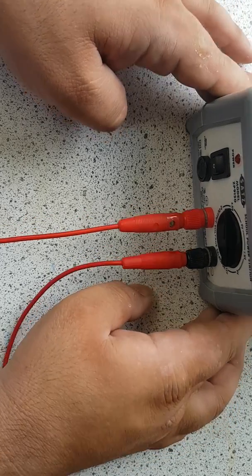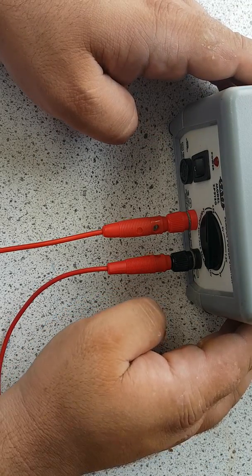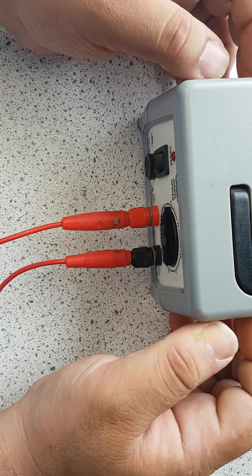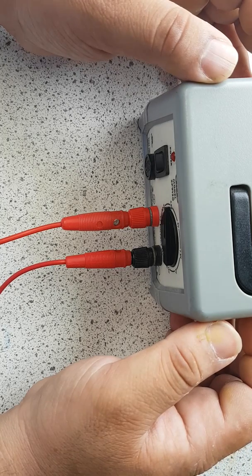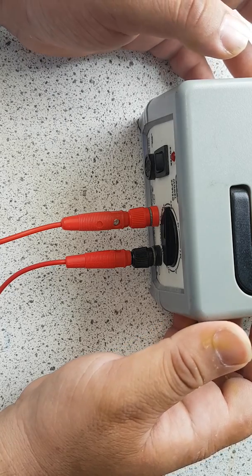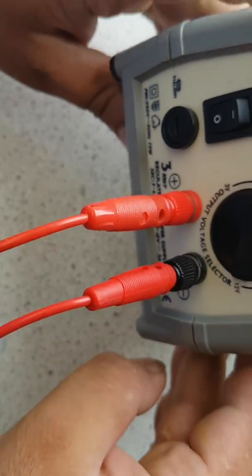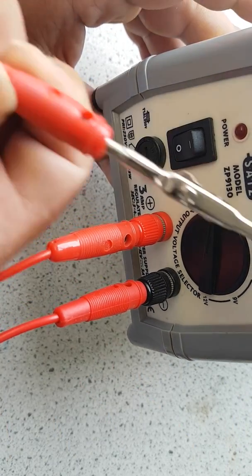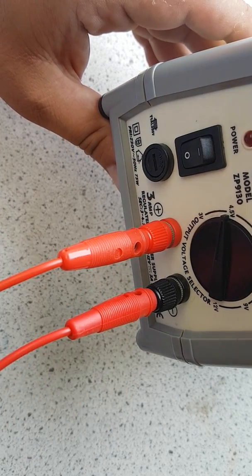So here's the power pack. This experiment is to do with electrolysis. Electrolysis is using electricity to split the bonds between molecules — for example, sodium chloride. We can use electricity to break the ionic bonds holding sodium and chloride ions together. The power pack is key because it forms the understanding of how electrolysis works.